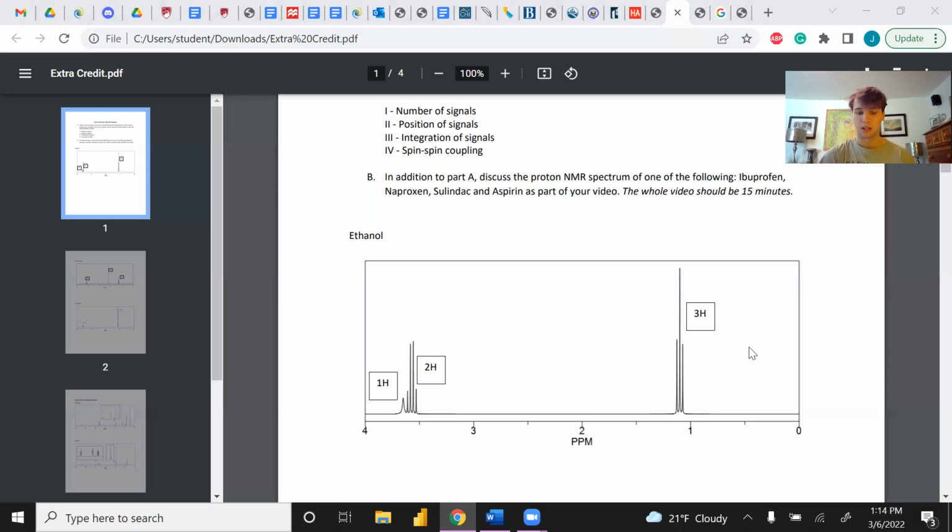So essentially, each atom or bond or anything like that has hydrogens around it. Well, not everything, but most of them have hydrogens around them, and these hydrogens essentially create electromagnetic interference. So when something is going into the NMR spec machine, these hydrogens create a bounce back, like a pushback against the original wave and how the NMR spec works. Now, this essentially means that when the wave is hitting, let's go with CH3 as an example in this spec.